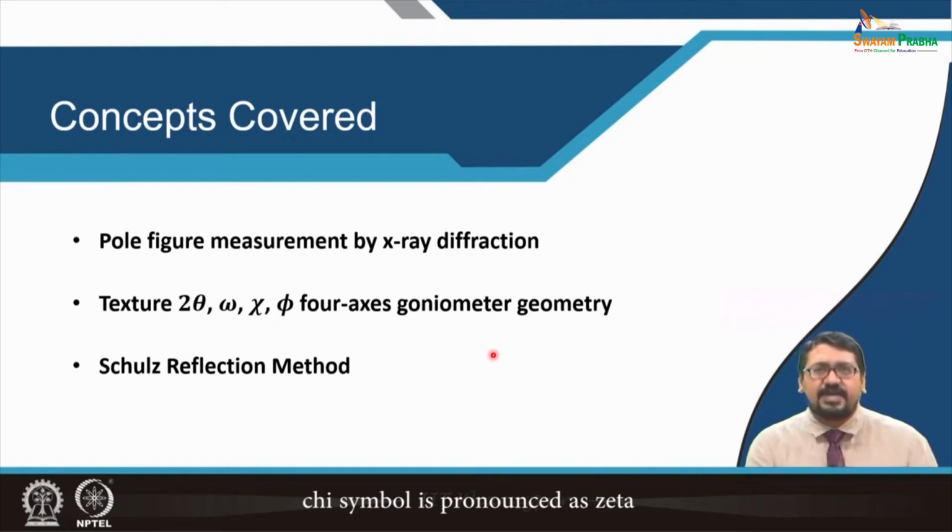Before we start this lecture, we understood how continuous X-ray is generated. We understood how characteristic X-rays form when the voltage is increased. We also understood that we use the mass absorption coefficient mechanism to take away the K beta radiation to increase the K alpha radiation's intensity.